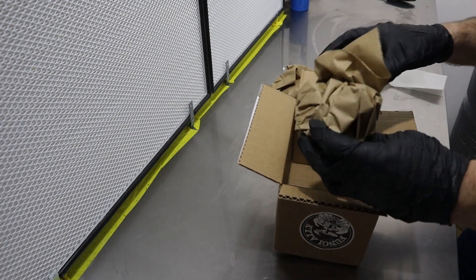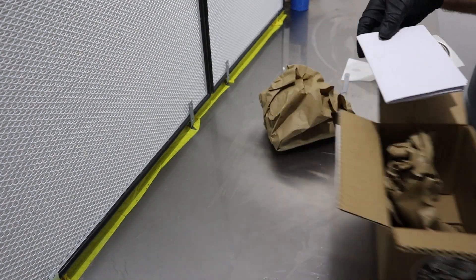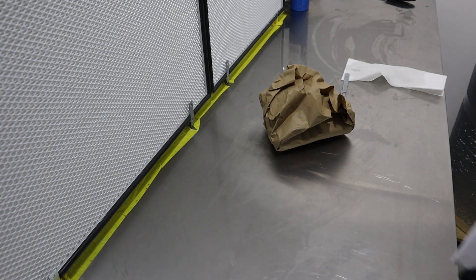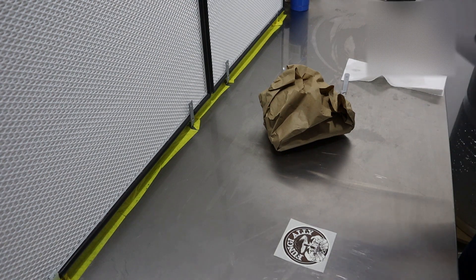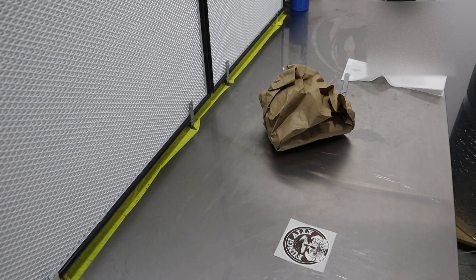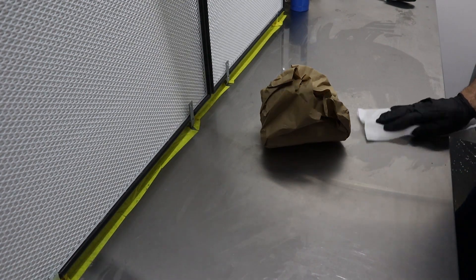You can see that's our package there. This box can go outside, this Fungially sticker will go somewhere, and we have my receipts and my permit. I have to get a permit through our local import, the Ministry of Primary Industries, just so I could import cultures into New Zealand. That Fungially sticker is going to go somewhere.